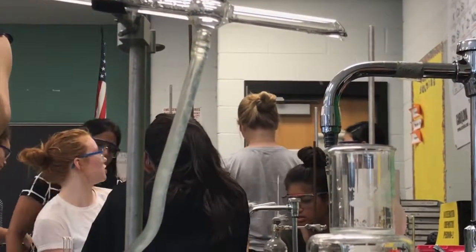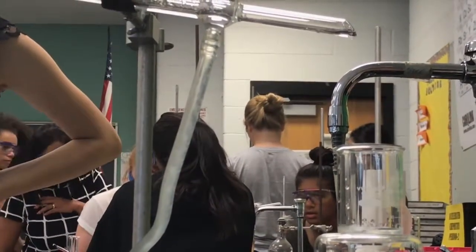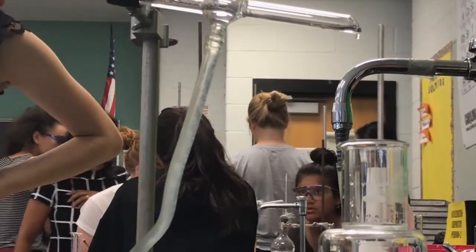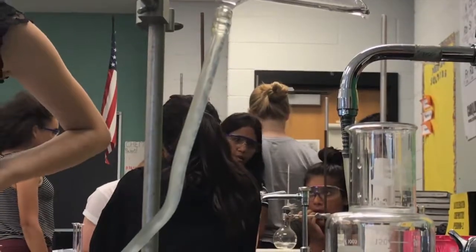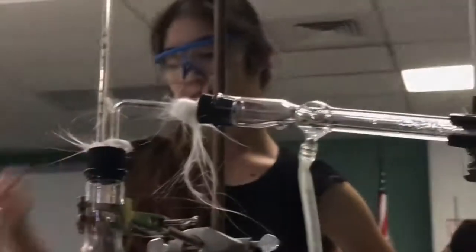We started our first reading when the thermometer inside the flask reached 35 degrees Celsius, and after every minute we checked the temperature. After the first drop of distillate inside the beaker, we lowered the temperature to 2.5 and obtained readings again after every minute.